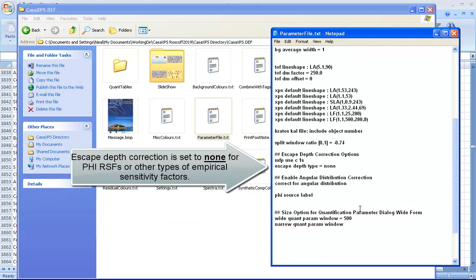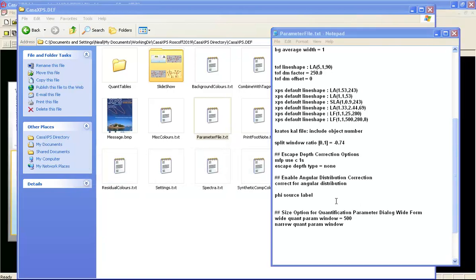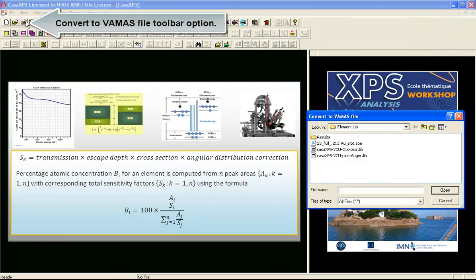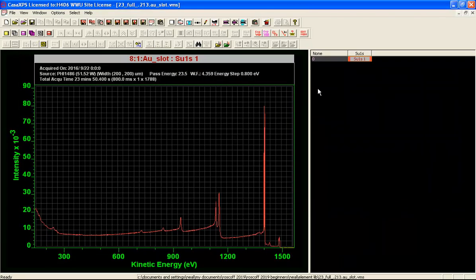When a file is converted, the VAMAS block will contain a source label that says PHI 1486 to match the element library. With a PHI source label in the configuration file, at the point that a file is created, you use the convert to VAMAS file dialog window. Selecting an SPE multipack file and pressing the open button converts the data within that file.